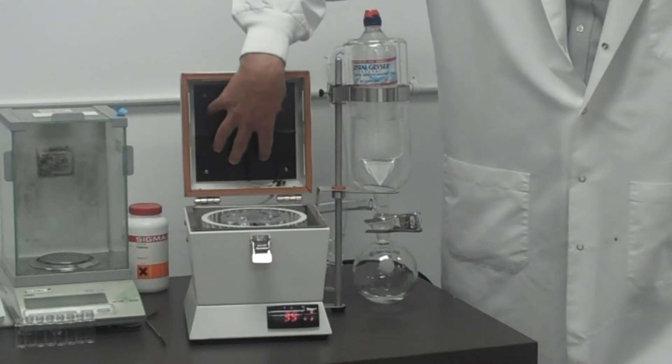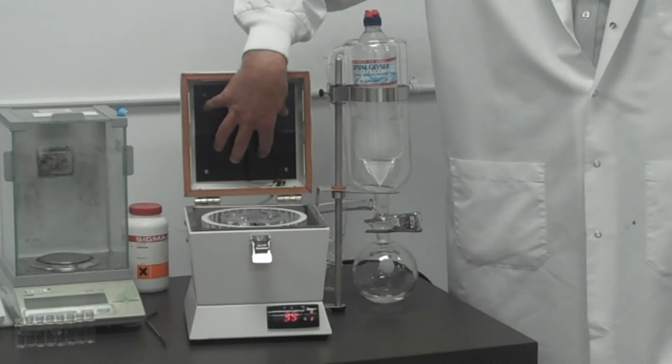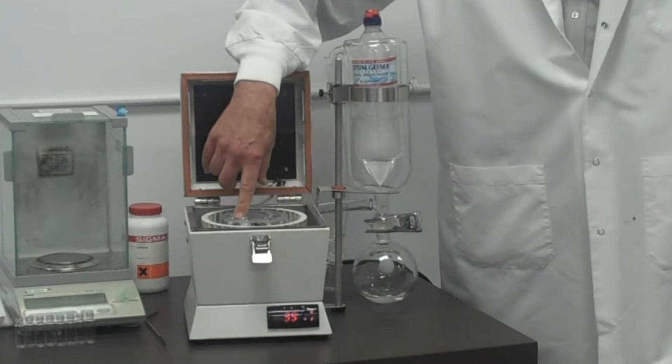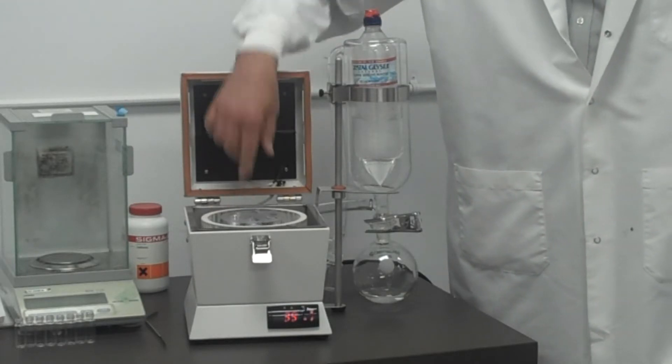The gas flow passes over this heater under the lid and across the surface of the solvents in the solvent containers.